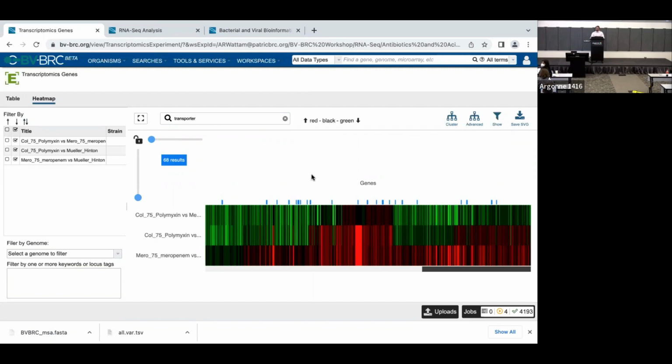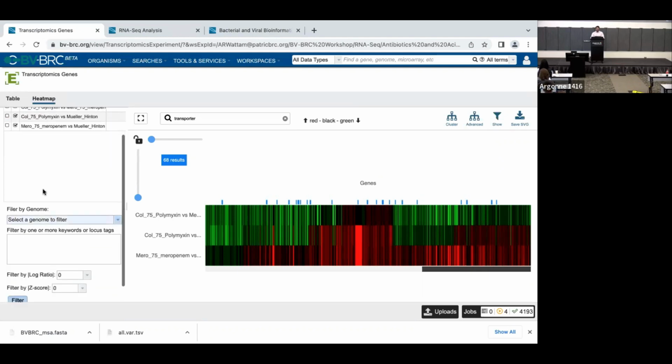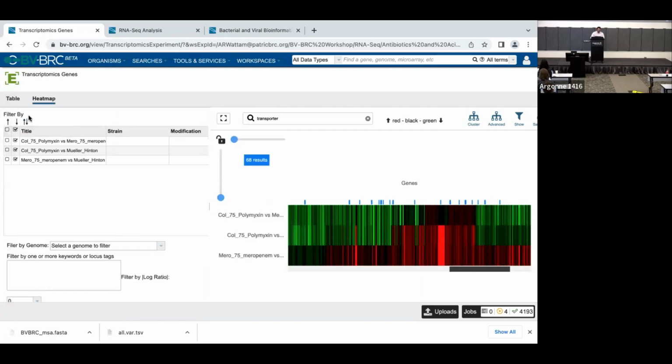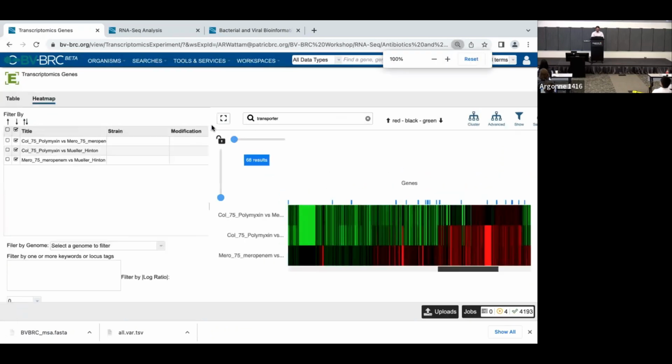Now, can you maybe reduce your font size or something? It looks like the checkboxes that you have on the side are not aligned for some reason. So it's supposed to have up, down, and don't care. There are 3 checkboxes there, and somehow only 2 are visible there. I don't know why. Do control minus maybe. No? No, yeah, I'm not really sure what's going on there.